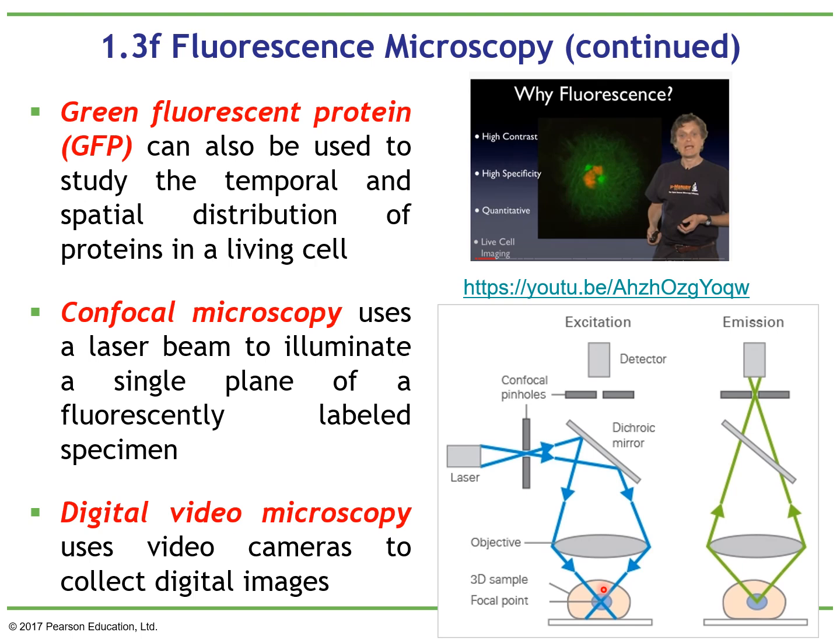So you need to store those pictures. They will have a camera and a computer that will collect all the pictures, and then you need software, which we will learn later in the class, to stack all those pictures to see all these dynamics that you will see in videos like this one if you want to watch it.